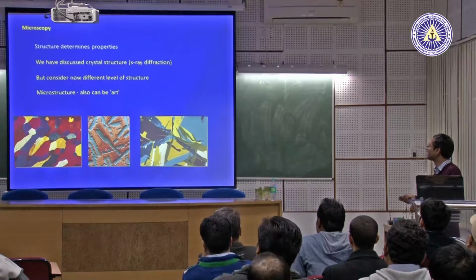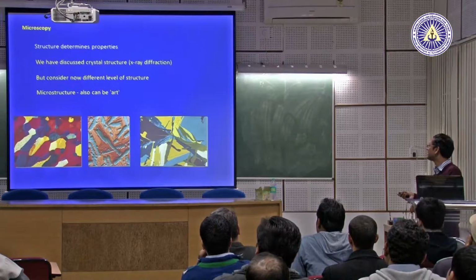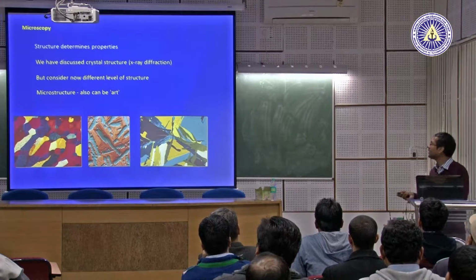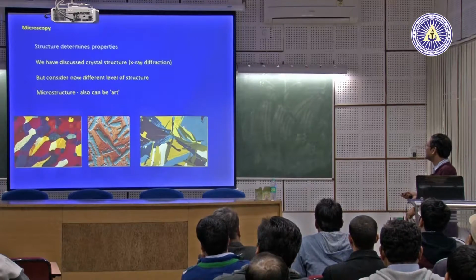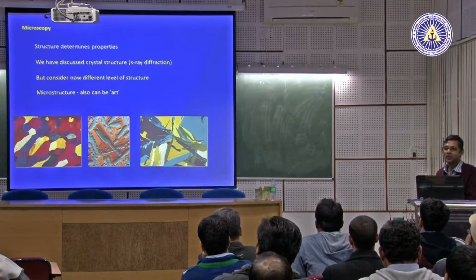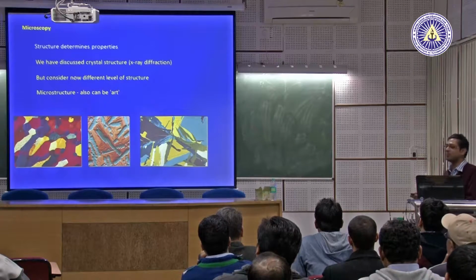This is a modified picture, a modified metallograph using color etchant. This is again an EBSD IPF map. So you can generate all kinds of microstructures. But why do you do that? To get information out of it.